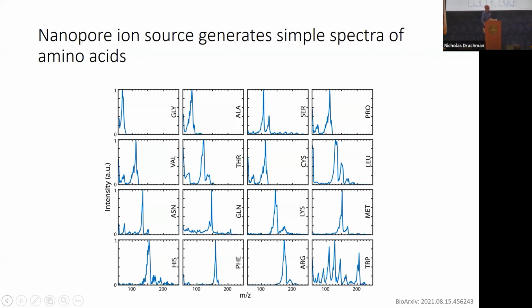So when you say flow a solution inside of the vacuum, you don't want to have water molecules, or do you actually have water molecules that immediately evaporate inside of the vacuum chamber? So the only place that any water is exposed to the vacuum is at the tip of the ion source. So it immediately evaporates? Well, there's water continuously evaporating, but it's not sufficient to cause freezing, or it's just such a small surface area that it doesn't really constitute a problem. But that is the reason we think that bigger tips don't work. So when we try tips that are a micron or larger, they tend to not work. And we believe that's because it's freezing because of evaporation.